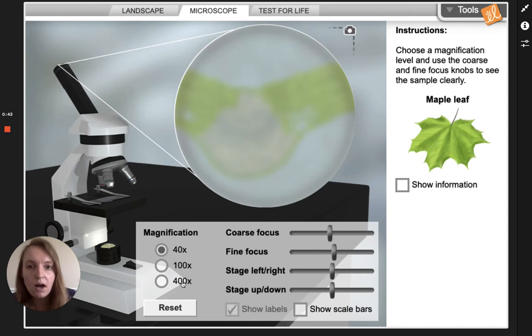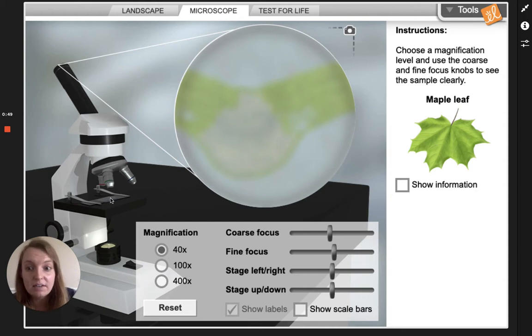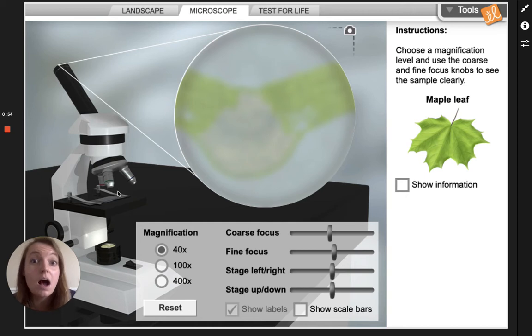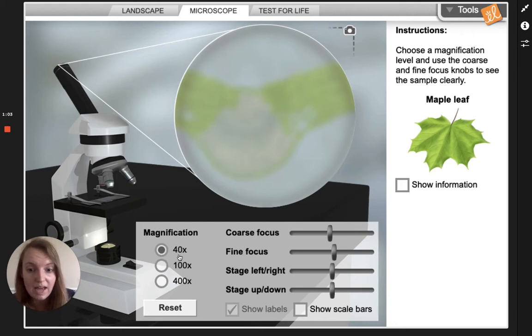With our microscope there are different levels of zooming in. These are called objectives. These little pieces that are sticking out of the microscope are the objectives, or the zoom that we're going to be looking at. We have to start on the lowest objective, the most zoomed out, and that's 40x.